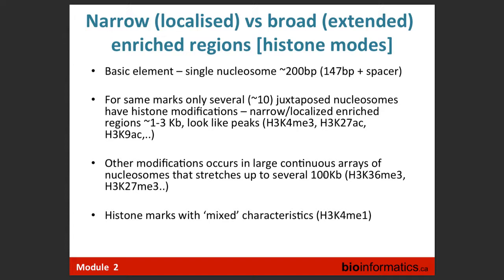And GC bias is a little bit of a common denominator of many biases, because this comes into sequencing. This comes into all kinds of amplification steps, which are maybe not sequence-related steps. So this is one of the biases which is important, and it can be positive, it can be negative. What is another? Sorry, you have a question.